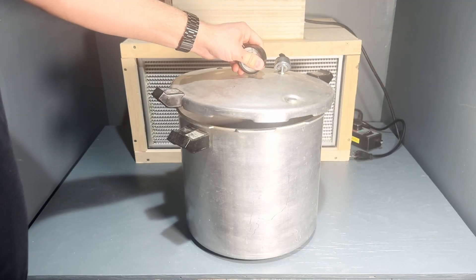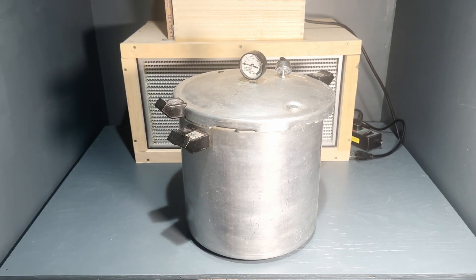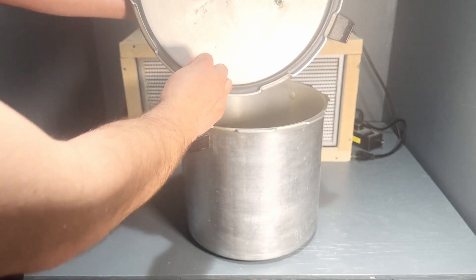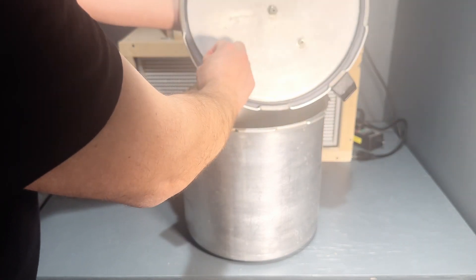You're going to need a pressure cooker — the bigger the better. I recommend the 23-quart pressure cookers by Presto; they're about $100. I got mine used on Facebook Marketplace for like $30. You can look on Craigslist and Facebook and usually find these at a good deal. You can buy a used pressure cooker — the only thing that goes bad on them is the gaskets, so you can order gaskets straight from Presto and just replace them if you buy an old one.